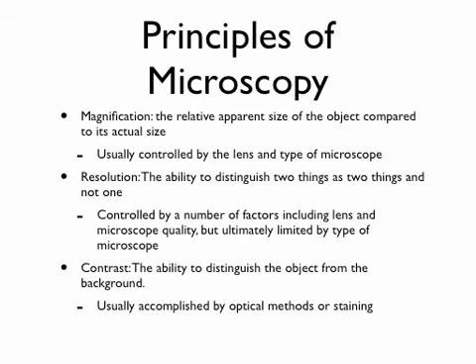Magnification by itself is not always very helpful. As a lot of you will be familiar with from snapping pictures with your camera or your phone, you can take a picture of something that's far away, and then you can zoom right in on that area and blow it up so that it's huge, and it will be greatly magnified. It will also be crap.